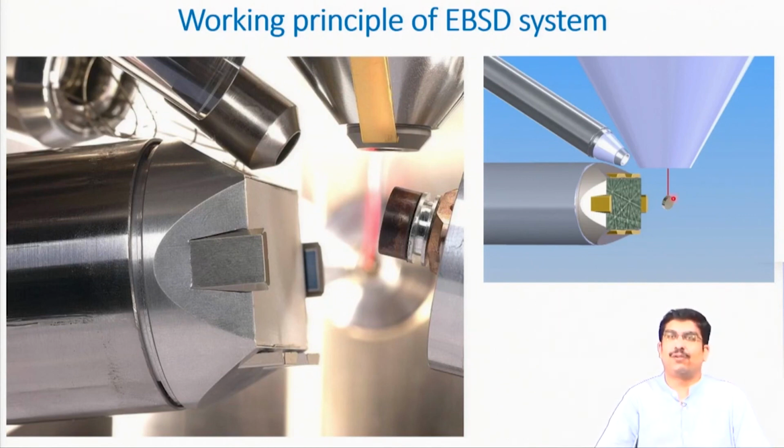And there it is forming these Kikuchi patterns. Many a times I get questions about why this tilting is there. Just go back to your SEM principle, where it is very clearly said that if you increase the tilting angle, then your backscattered electron yield increases.